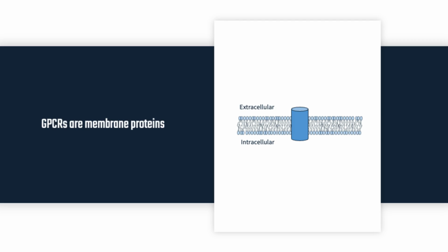First of all, the immobilization-based technology will require the use of a reference surface, and you will have to subtract the signal of this reference surface to subtract the background, or also the non-specific signal. And unfortunately, the detergent can increase the background signal, and this might differ on the reference channel compared to the active channel, leading to some difficulties in analyzing the signal.